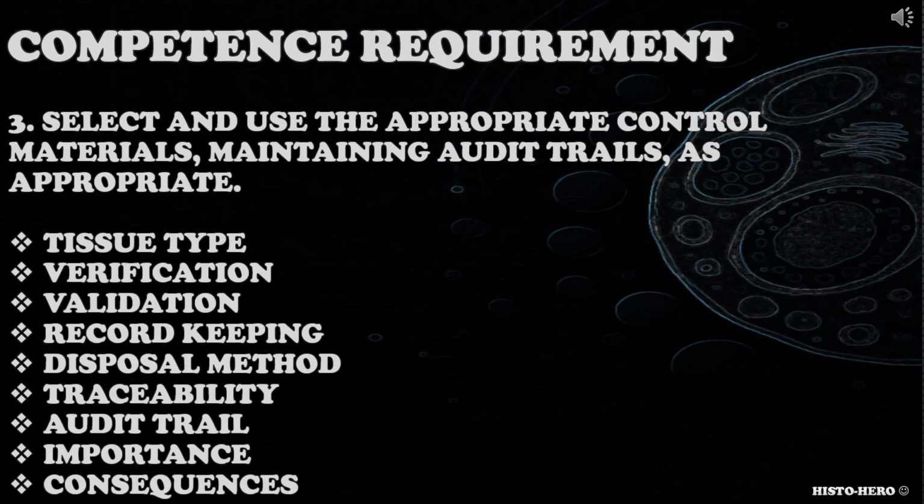When addressing this competence requirement, candidate could consider tissue types they would use, verification, validation of control material, record keeping for control blocks and control slides, disposal of control material, traceability for samples used, audit trail, importance of selecting correct control material, consequences of not using correct controls.